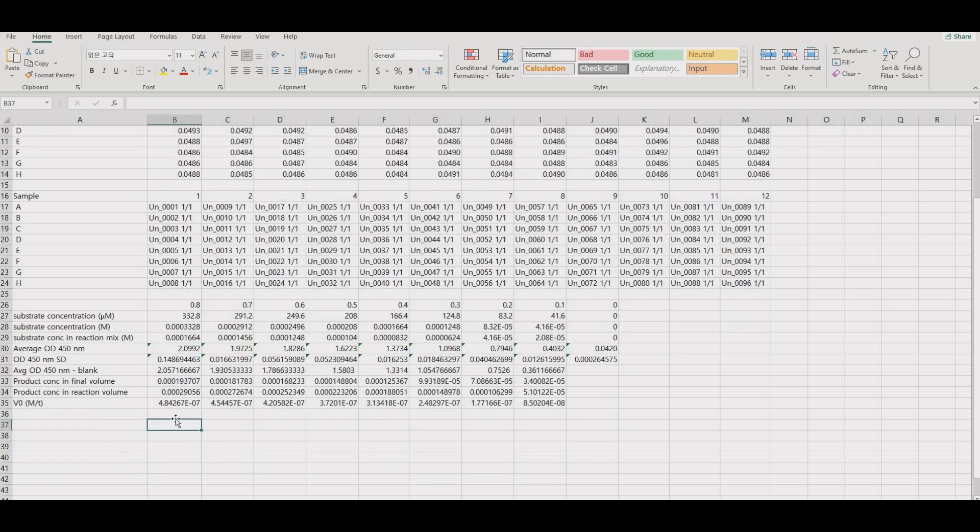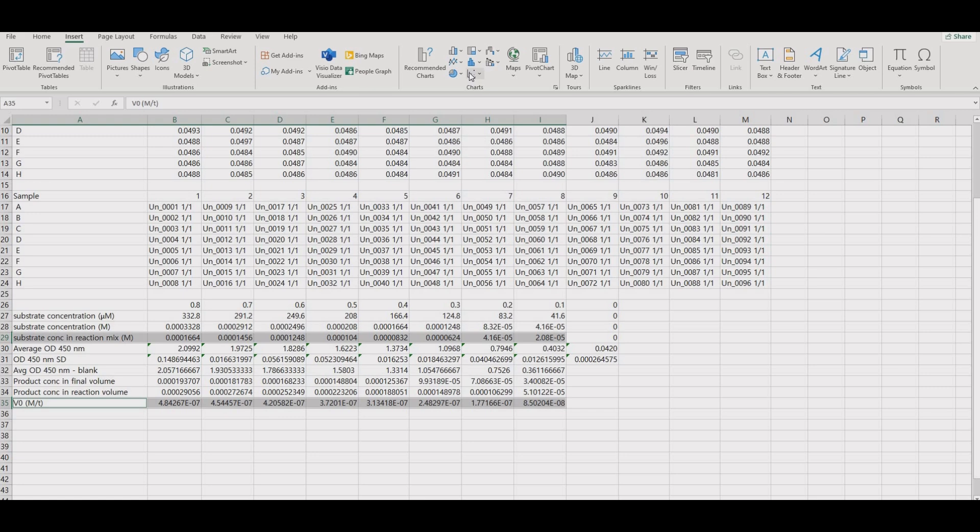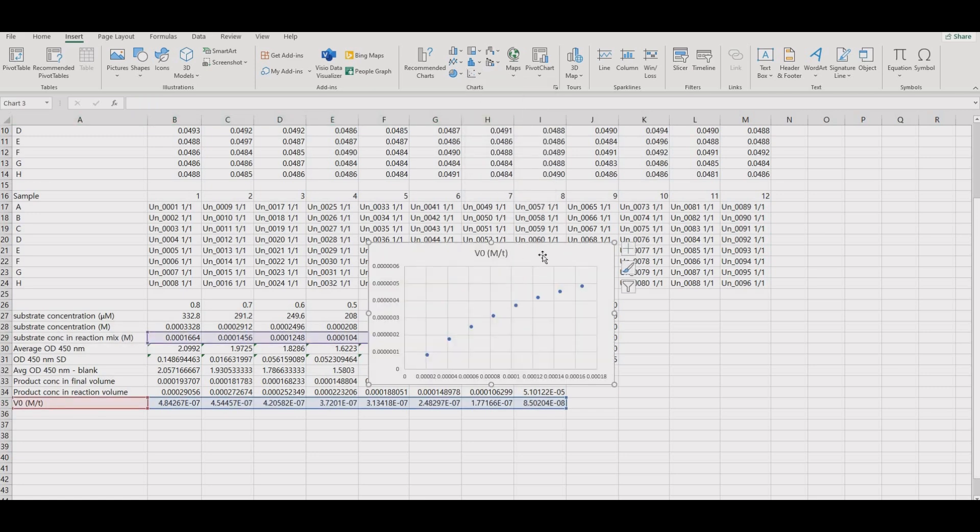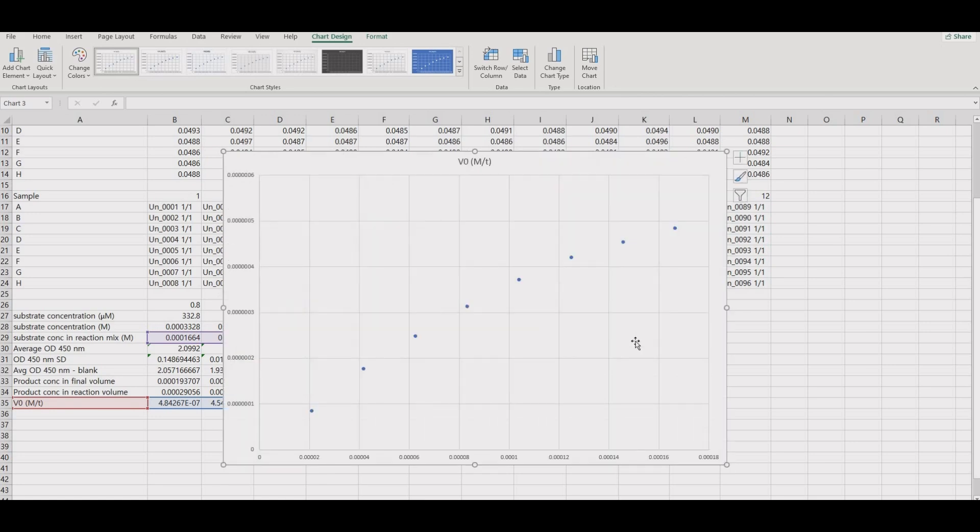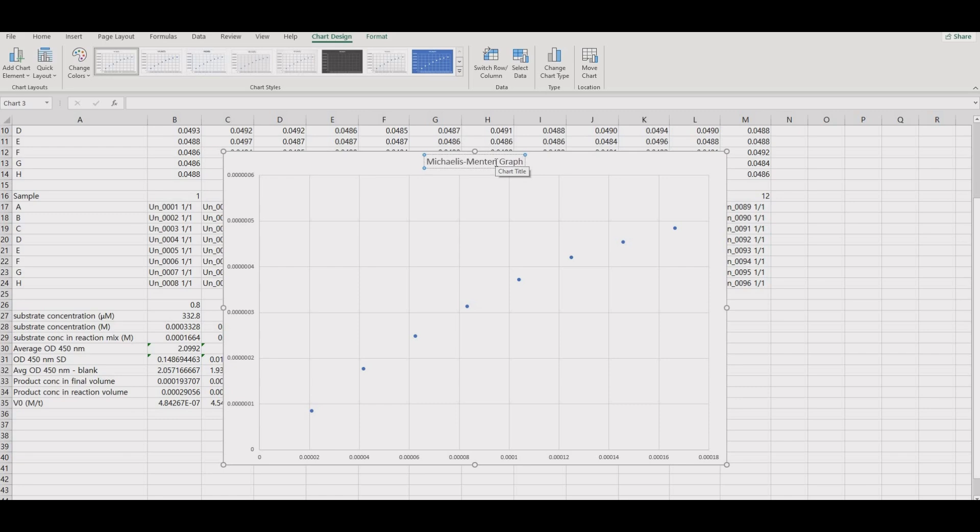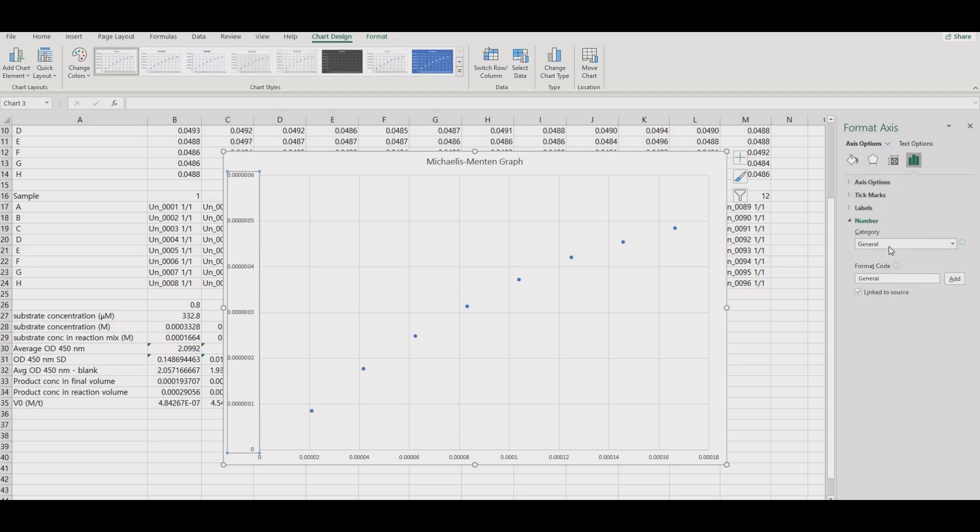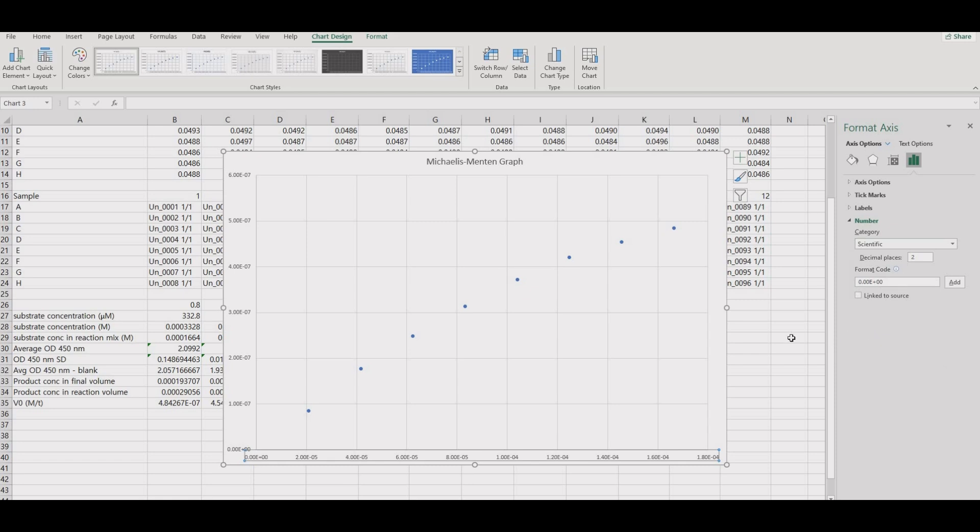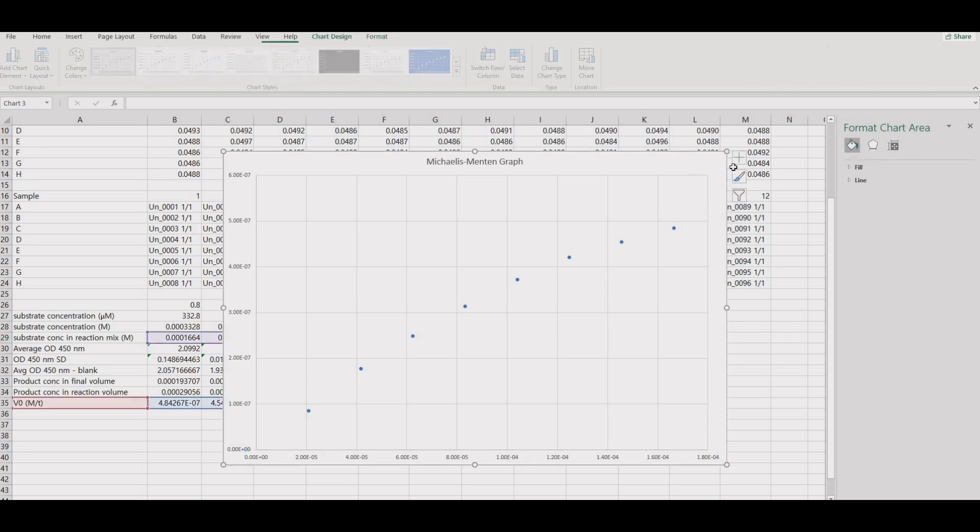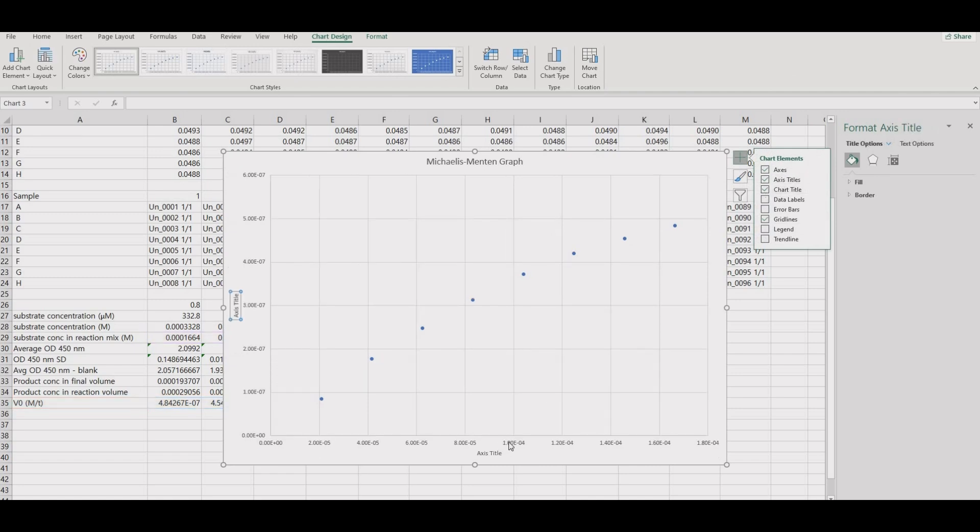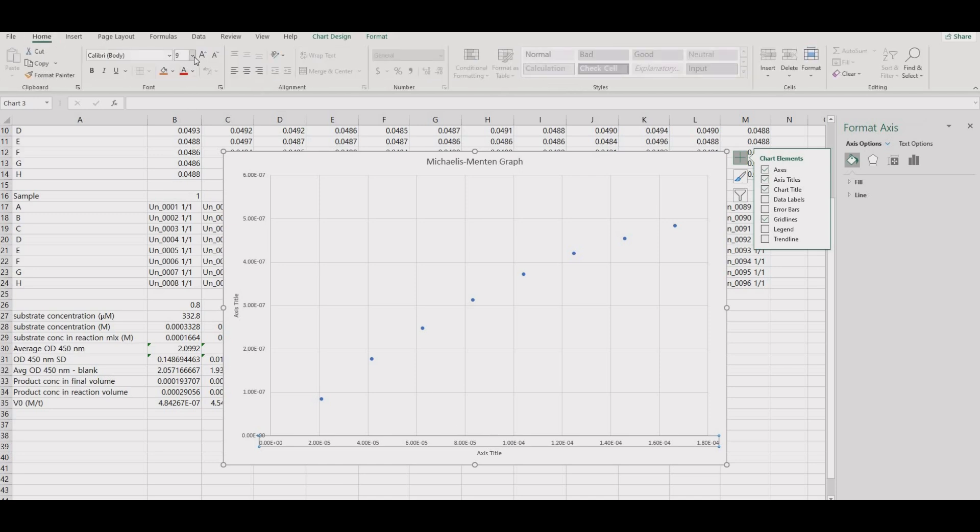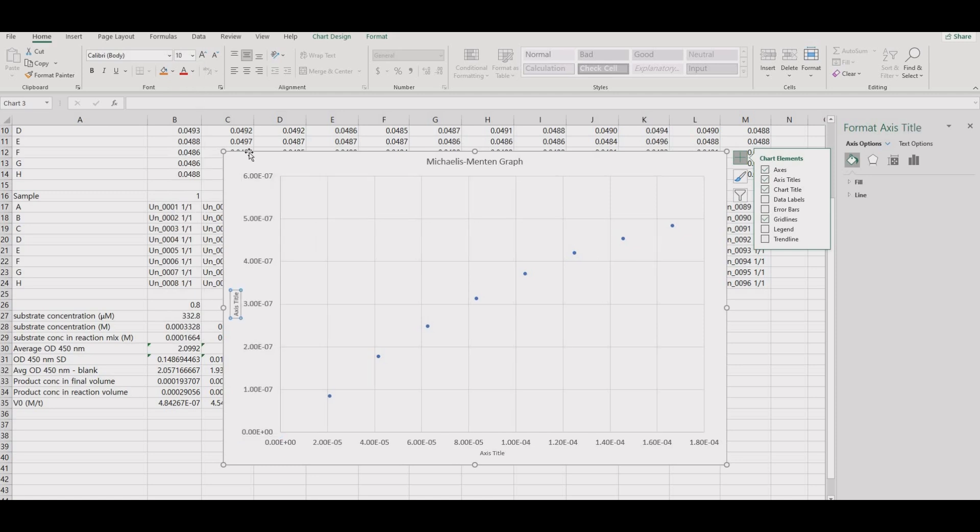Now, we can plot V0 versus substrate concentration to get the Michaelis-Menten graph. I will format the axis label numbers to be easier to read. You can also make the font larger. I will not input the axis titles for now but you should when you do the Excel processing. You don't need a trendline for this graph.